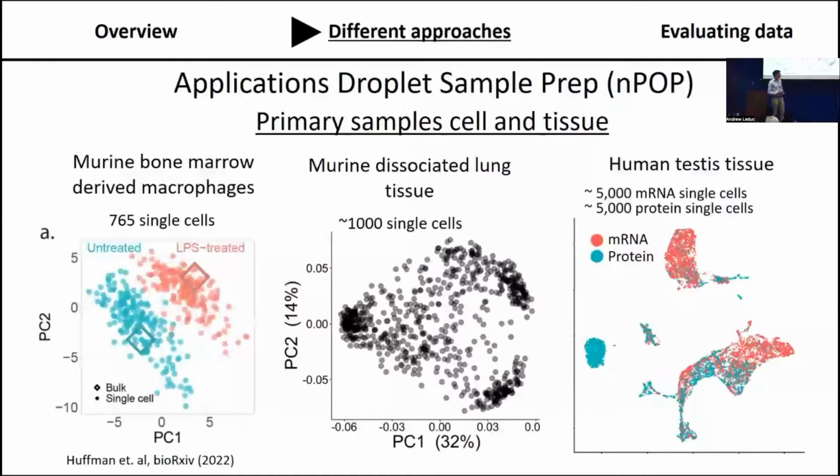Khan, where this was a nice success for the nPOP sample preparation method, because previously we had a great deal of difficulty preparing these samples isolated by the FACS machines, and there was a high level of contamination, and it was difficult to distinguish signal from the protein that we were measuring from contamination. These are all advancements that have been enabled by these small volumes and this flexible design.